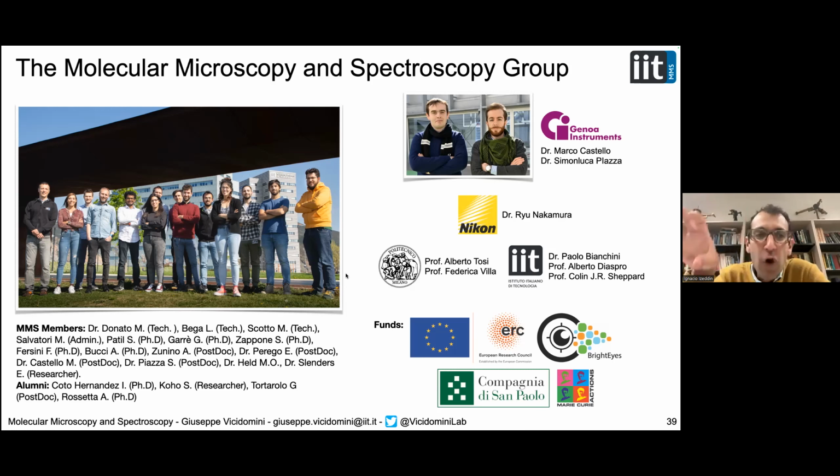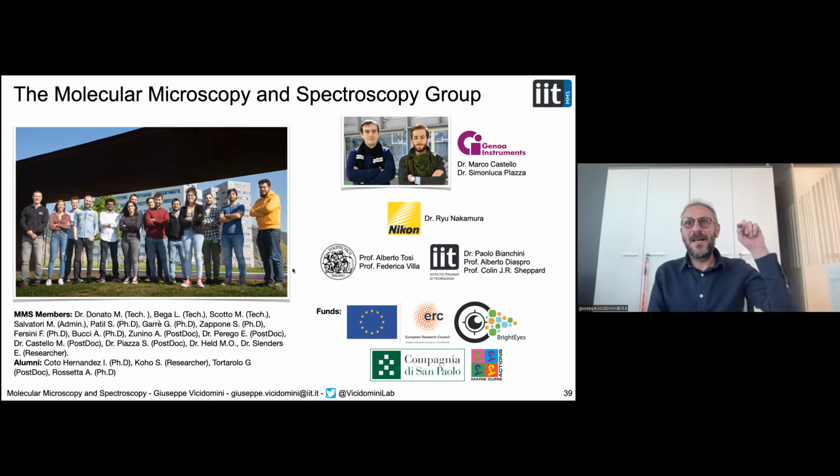Okay, but MINFLUX is following the particle, while your approach would be to create an image and detect the particle on the image, right? The other beauty is that one of the limitations... I'm not saying anything bad about MINFLUX, but you need to know that the molecule is in the center of your scanning, because you don't have an image of your molecule. Now we have an image, so that's no longer a constraint. Basically, we have a larger field of view compared to MINFLUX. Then obviously you can scan across all your sample to build up a large image and increase the field of view. But what I want to say is that in these cases you introduce an element that provides more information, and by elaborating this information you can gain in localization precision, for example, in MINFLUX.